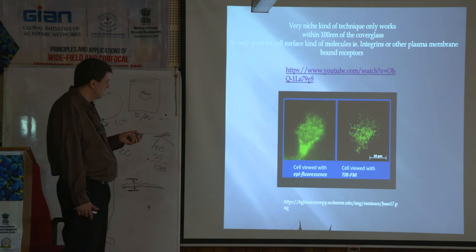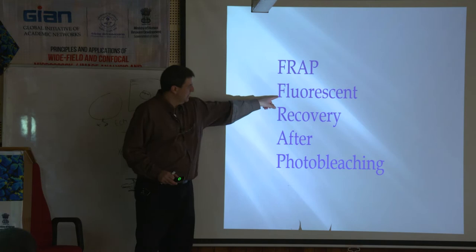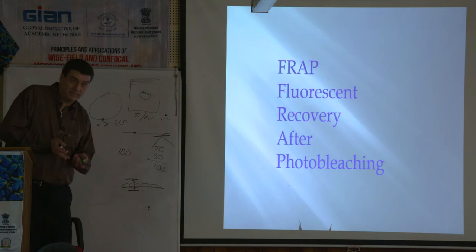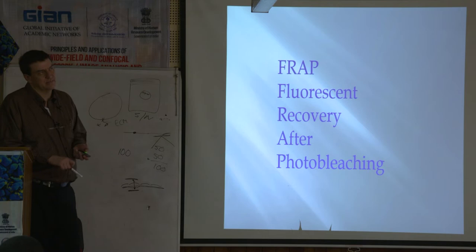Okay, FRAP. This is another one you'll hear. Like, people love to use these acronyms. Like, they like to use the first letter to describe the technique. So this is fluorescence recovery after photobleaching. So sometimes bleaching is what you want to do. And a lot of times we talk about, no, you don't want to do it, but for this technique, you want to do it. I work with a couple labs. I used to do some of this stuff, not very often. I think I just didn't work with the right people, but I've done it. It's pretty cool. It's actually really cool to watch it.